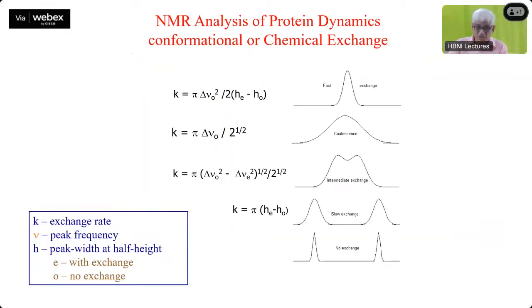Okay, so the chemical exchange I have already shown you here, a particular kind of situation there. How does it depend upon the chemical shift difference? Earlier I showed you the exchange rate dependence, how it goes. Now it is not exchange rate alone. It is the exchange rate vis-a-vis the chemical shift difference between the two, how much they are separated with respect to each other. So with regard to that, you have various patterns appearing.